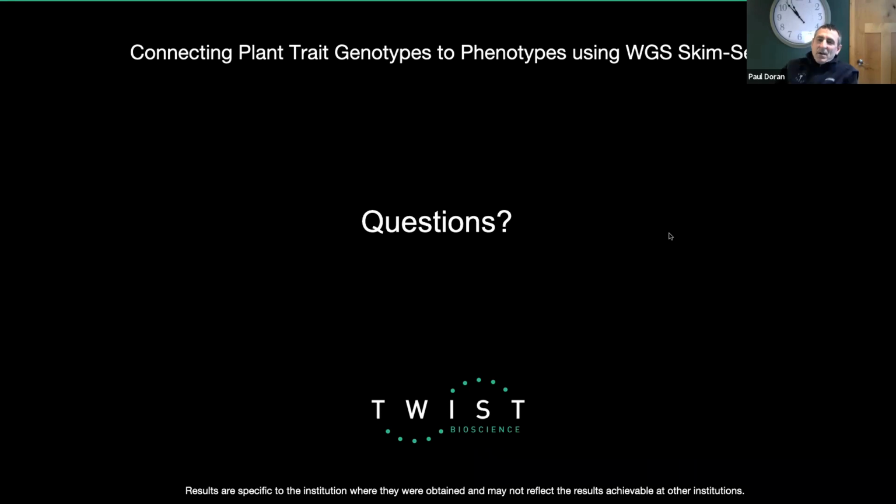Okay, excellent. So, hey, I was going to ask you this question as well, but Rick Nipper has brought it up. He says, "Hi, Jason, nice presentation. Joined late, so it might have already been covered, but curious as to know what kind of sequencing coverage you are aiming for your mapping population." So I think you did mention that, but my question as a follow-up is, how did you determine that level of coverage?